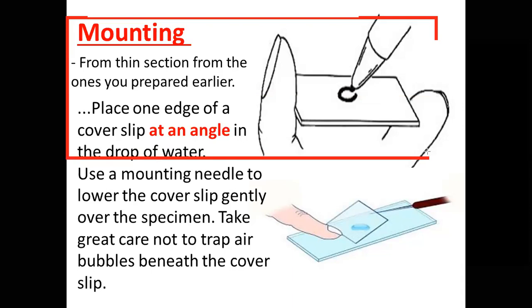Then the technique of placing the cover slip is what most students don't understand. Of course, you are supposed to hold the slide with your hand, and then look at what I'm doing. These 2 fingers are free. I don't know why I forgot the slides, but then you place the cover slip.